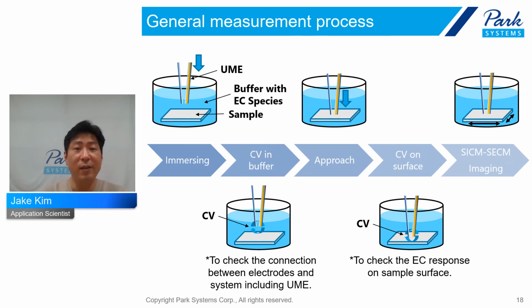For SICM-SECM imaging, the cyclic voltammetry, or CV, curve is first measured by a combined potential step. After immersing the UME in the buffer, the CV is measured and the SICM-SECM connection is confirmed as a result.